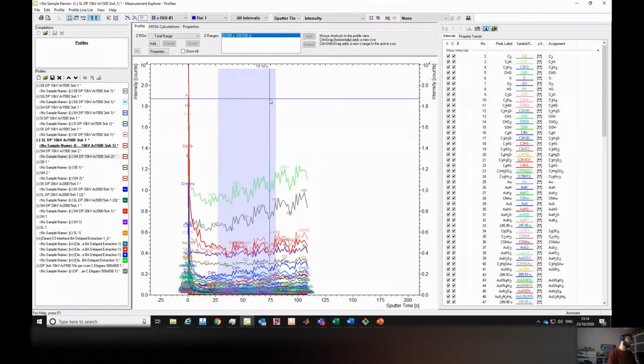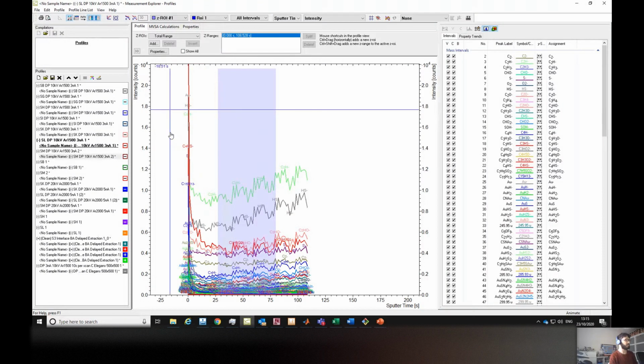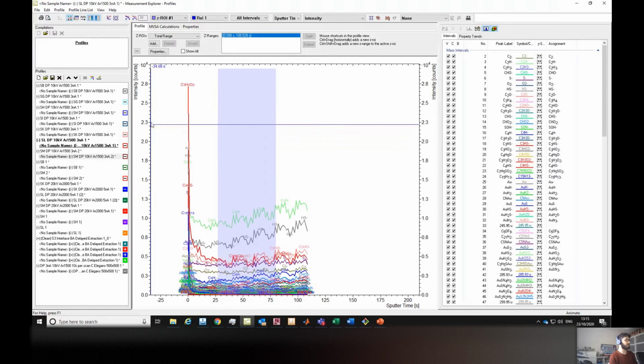So now, obviously I skipped all the part where we carefully select the peak, so do a peak search or things like this, because we already talked about this before. I just don't want to waste time today on this. So once you have this, you just need to export.